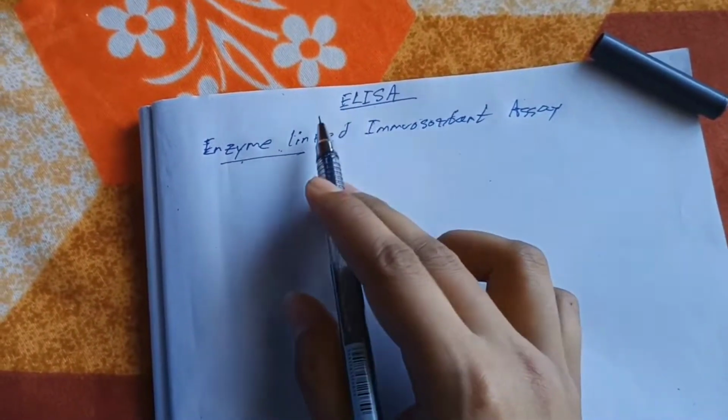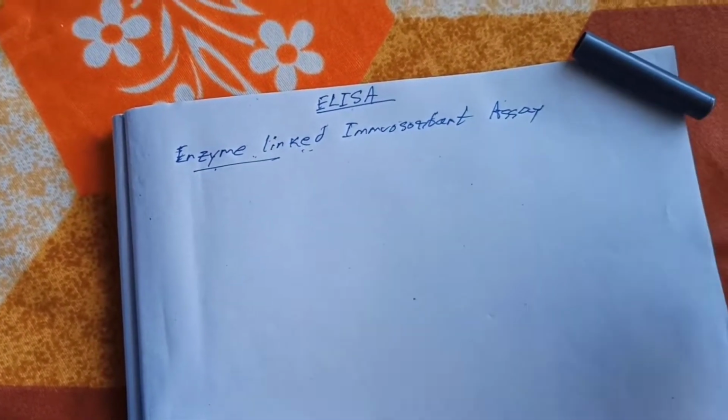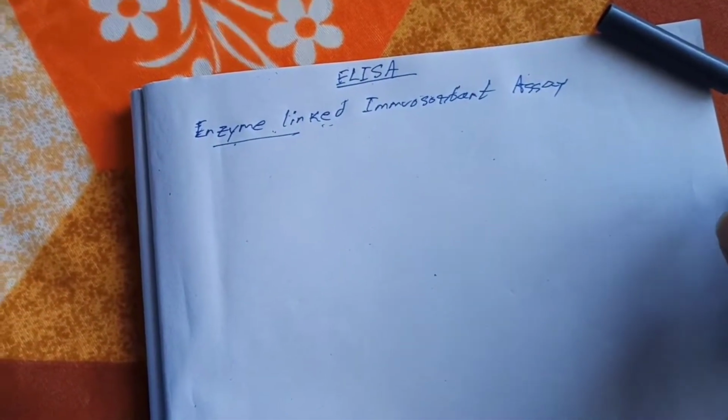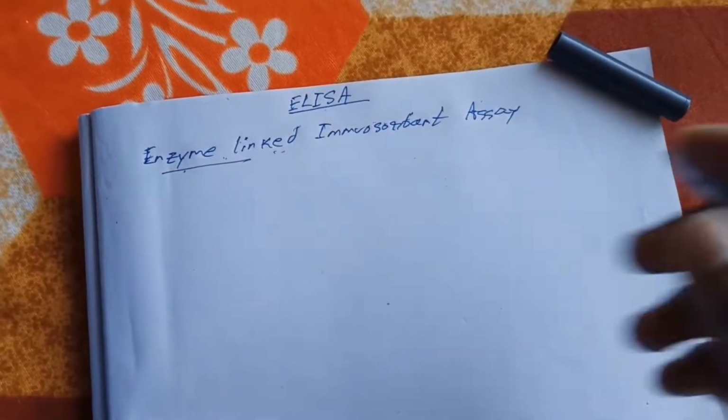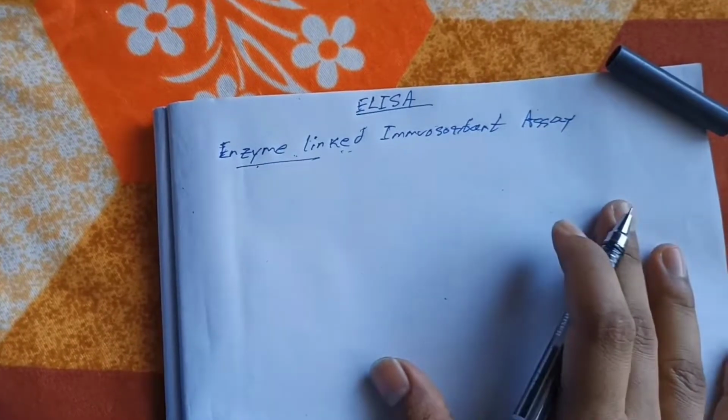So today I'm going to talk about ELISA, which is enzyme linked immunosorbent assay. I'm not going to talk about the procedures, I'm going to talk about the basic mechanism or the principle. You can see the procedures from any book or PDFs. Okay, so what is ELISA?